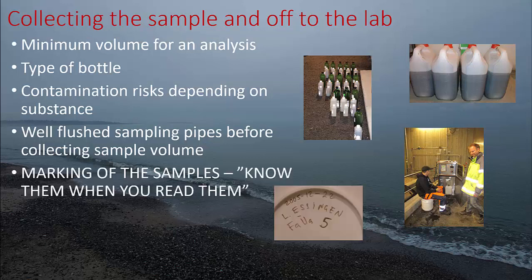Next thing, marking of the samples. Know them when you read them. Over the years, I've been in all kinds of water treatment plants, sewage treatment plants, process plants, you name it. And one of the things when I've been working there: sampling is a small part of the job, but there are a lot of samples going on. And when you mark a sample, be kind to yourself and have longer text.